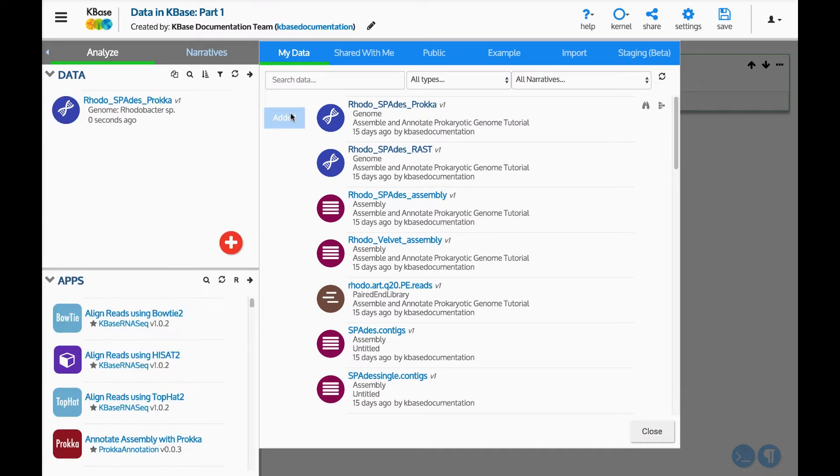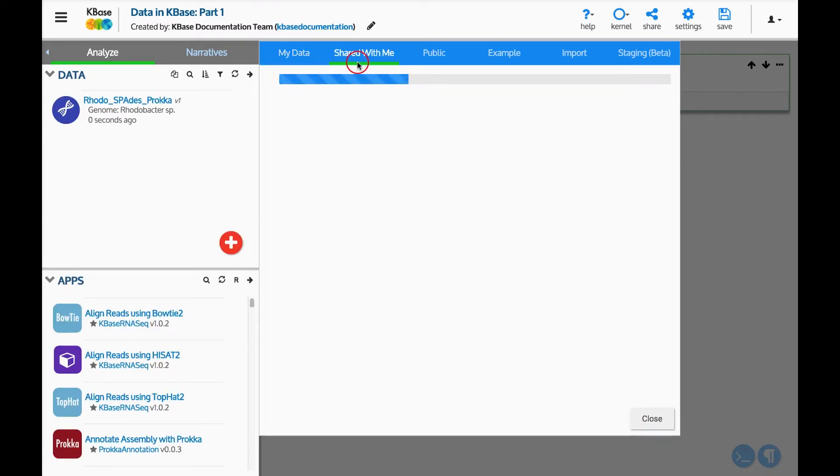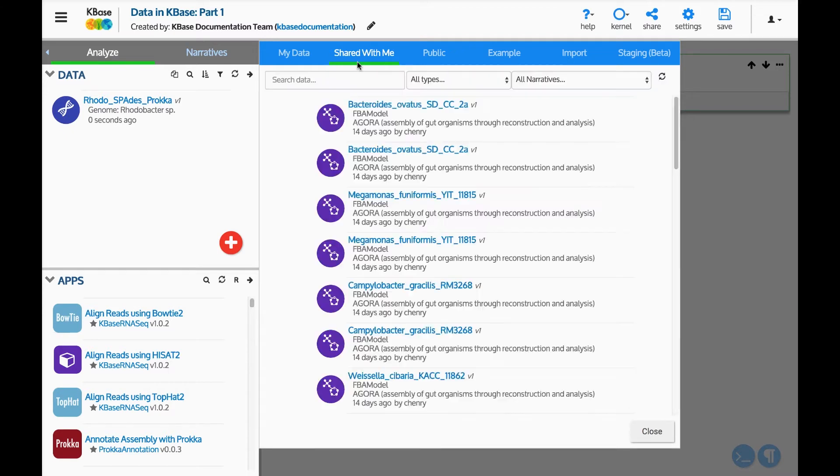The Shared With Me tab contains data from narratives that have been shared with you by collaborators. It will be empty if no narratives with data have been shared with you.